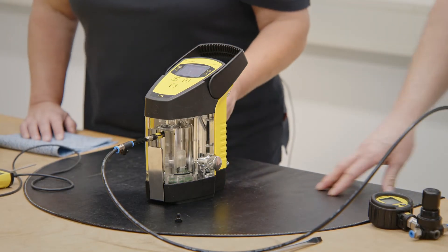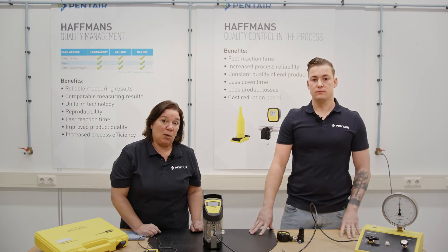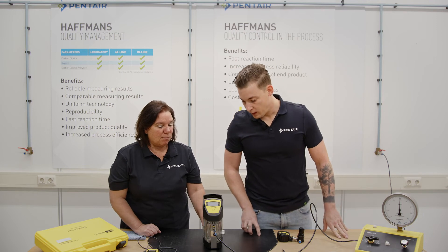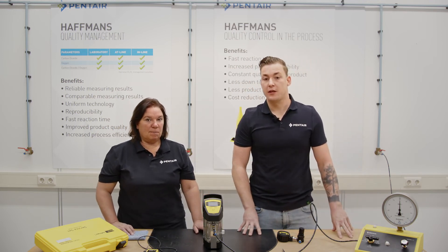When the calibration has succeeded, the instrument automatically returns to the main menu. When all seems fine, remove the calibration bolt from the measurement chamber and replace it with the standard PVC screw again.